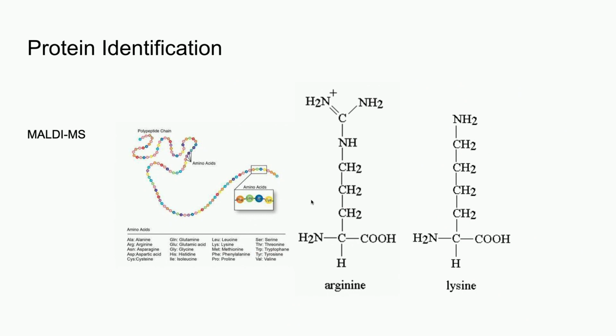Once separated, proteins can be characterized and identified through mass spectrometry techniques. I will discuss two techniques. First, MALDI-MS. MALDI-MS begins with the addition of the enzyme trypsin, which will cleave the arginine and lysine amino acids in the peptide sequence of the protein on their C terminal. Once the protein fragments have been made, their presence and quantity is measured via use of mass spectroscopy. The results of mass spectroscopy can be compared with databases containing known quantities for different proteins and enable a researcher to find a match.